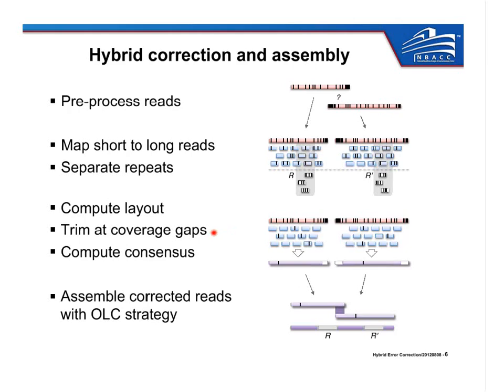If that doesn't get properly trimmed by the PacBio analysis software, that could confuse an assembly program because it will look like a chimeric read. The insight there is that we will have no short reads expected to map to those hairpin adapters, and no short reads expected to map across that chimeric junction. So anywhere we see a region of 0 coverage in the PacBio read, we tend to trim that off because it's a suspected chimera.